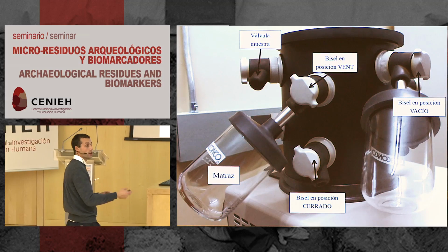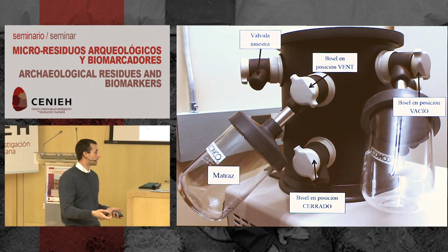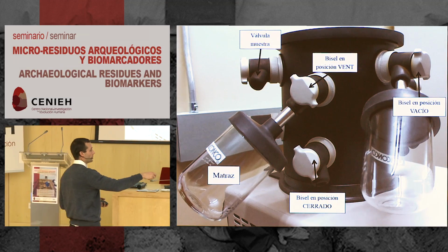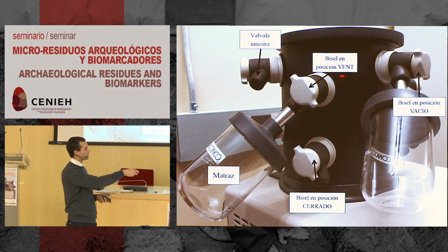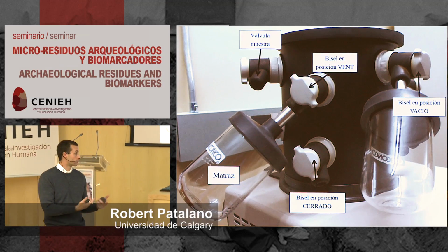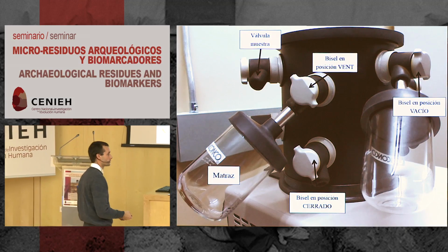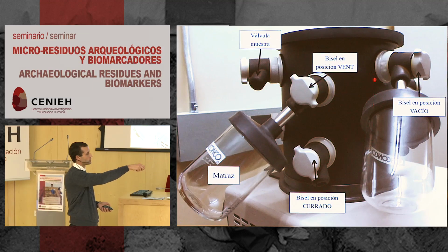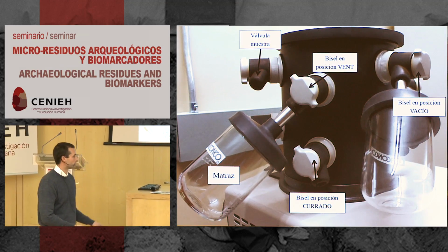And what happens is your samples, usually you keep your samples individually in a collection vial or some other means, and the samples themselves go in these flasks. And then you can control whether or not pressure is going to change. You can open and close these valves here, and that allows the freeze dryer, the equipment itself, to extract any of the sublimated gases, any of the water vapor itself. In here, the ice will collect in this chamber here, and then eventually it melts out, and you collect the water afterwards.